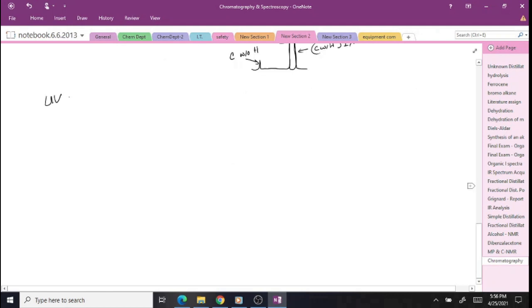All right, and we will finish then with UV and Gaussian. Again, what you can expect on the final exam will be similar to what you did for your report. So for the analysis for the report, for the ultraviolet and visible spectrum, the thing that we were looking for was primarily relative levels of conjugation. And of course, there should also be something with respect to color.